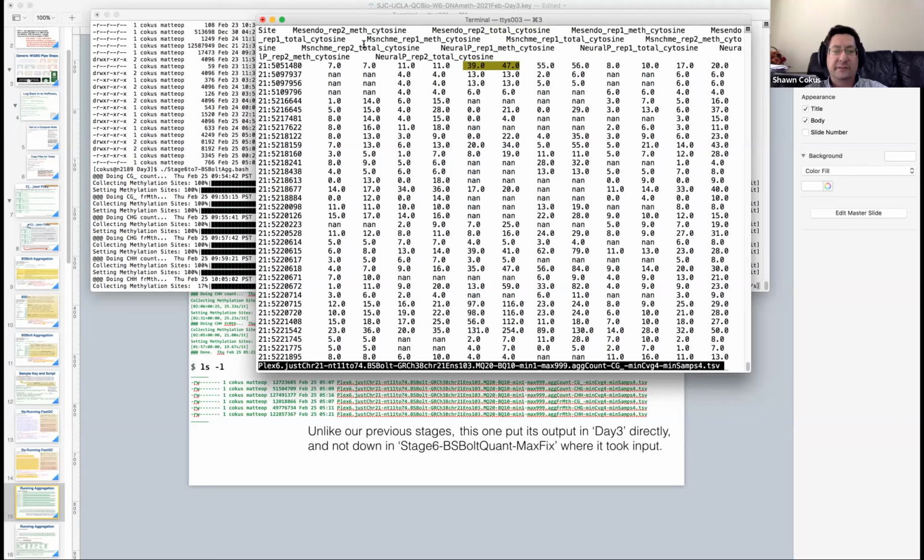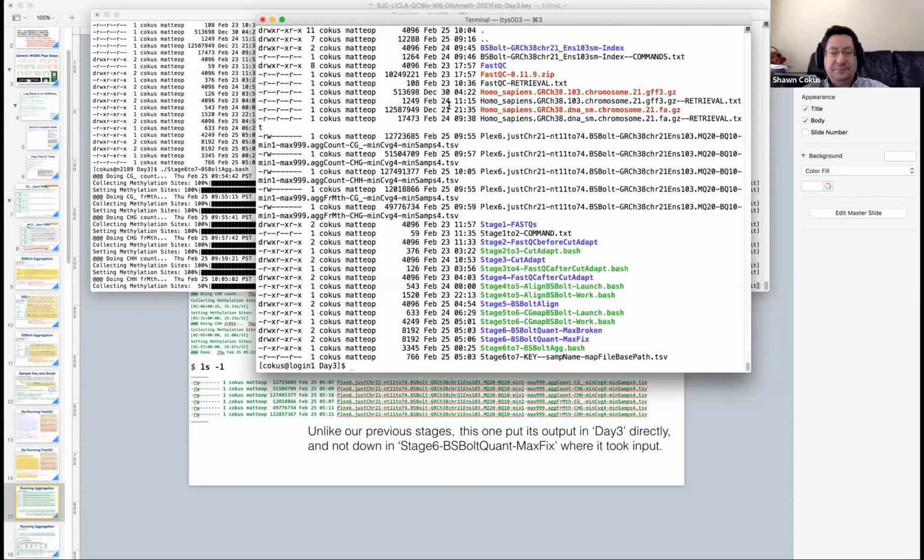That's the third tissue, whatever that is. So that's the third sample. So here's first sample, second sample. So mesenchyme rep 1 is 39 out of 47 in first place. All right, anyway, this is useful because it's equivalent to the fraction meth file. Just take this and divide by this. But it also gives us the coverage information, which is important too. So this is the file we actually like more. When we import it into R, this is the one we like more.